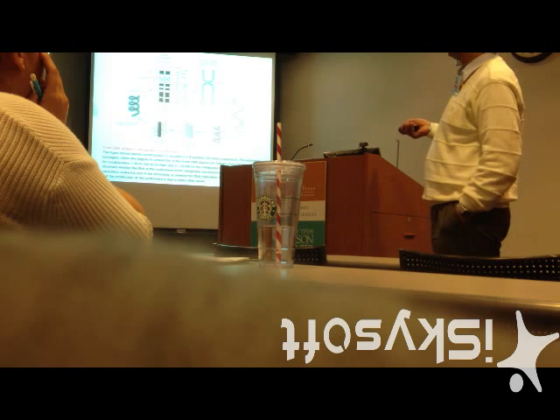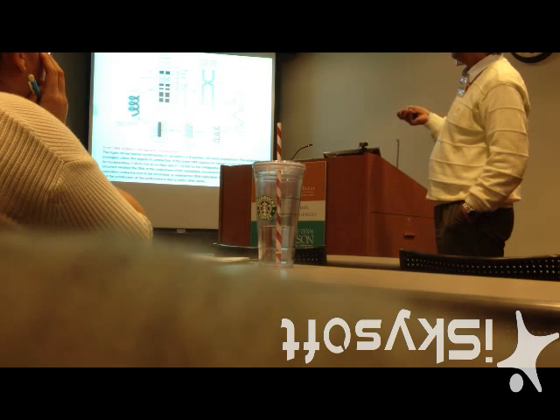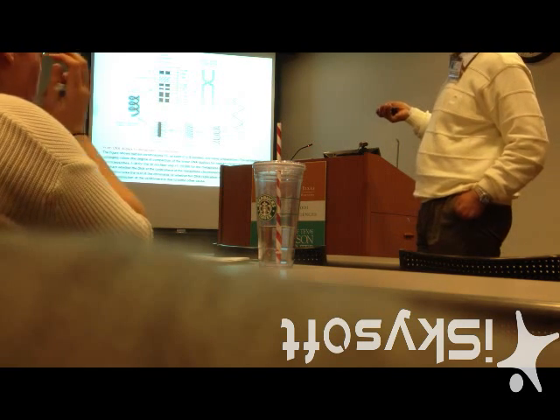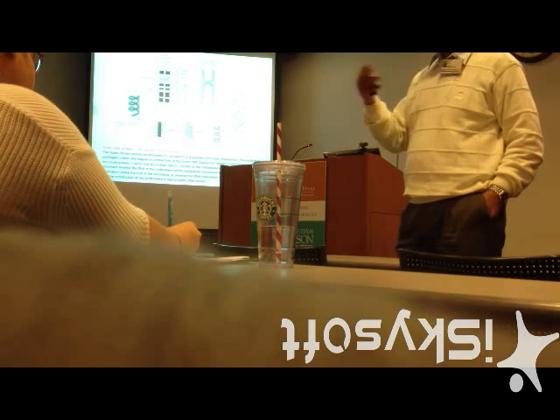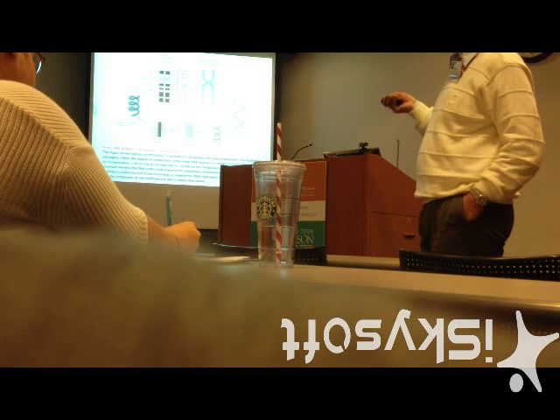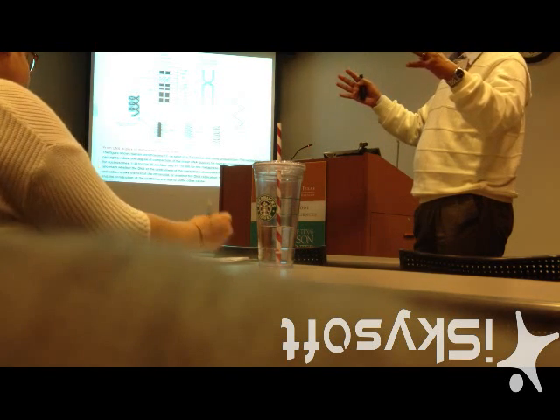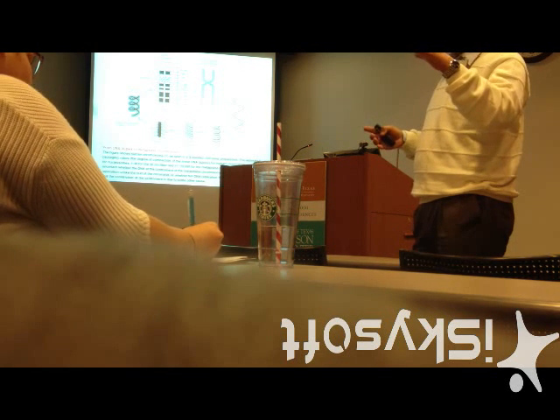All right. This is a staining pattern you do not see with simple staining of the chromosomes, but you have to do so. This is showing the G banding pattern. Again, this G banding can be done at different resolutions. In other words, depending on how condensed the chromosomes are, the number of bands vary. So this is typically from, I believe, a 400 band preparation, when the entire chromosomal content of a human cell can be distinguished at the 400 band resolution level.